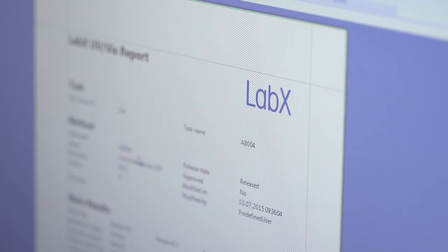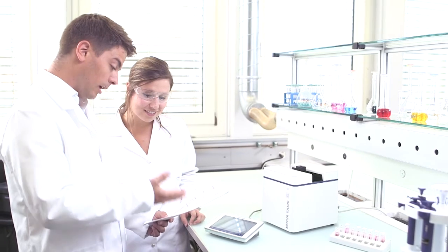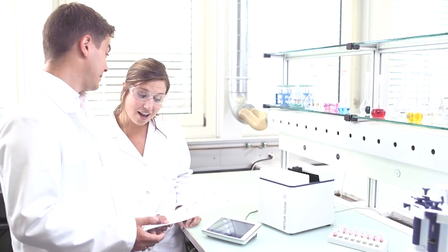LabX is fully adaptable to meet your needs. The many options in LabX allow you to simplify the way you work, ensuring that transcription errors and omissions are a thing of the past. LabX takes care of all the hard work, enhancing productivity and decreasing manual interactions.